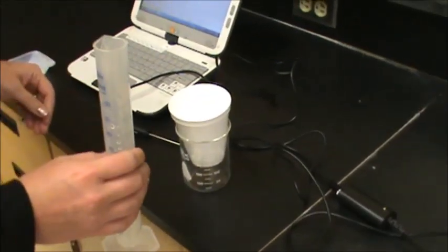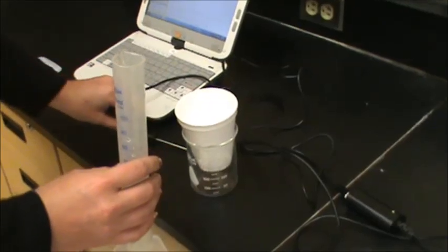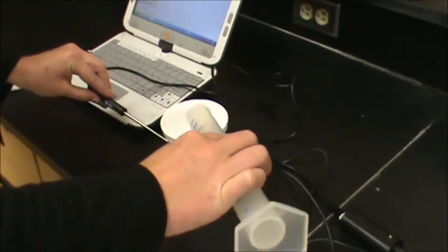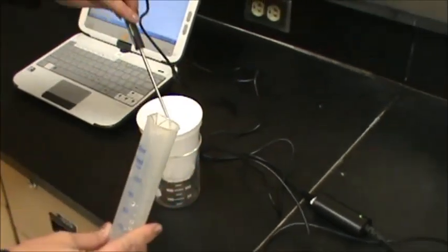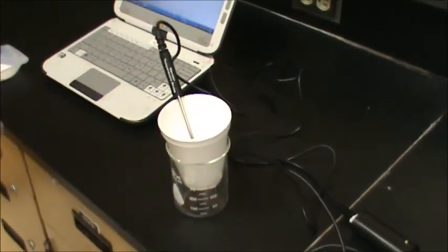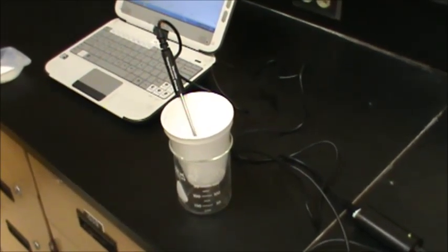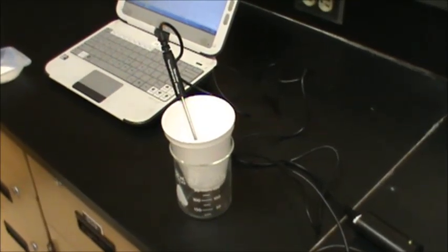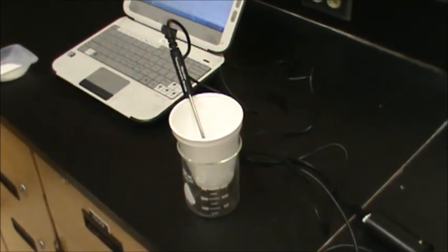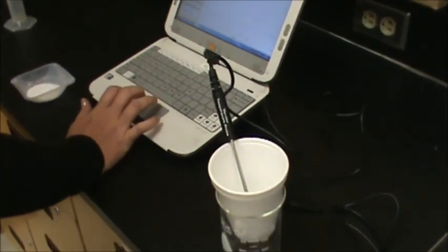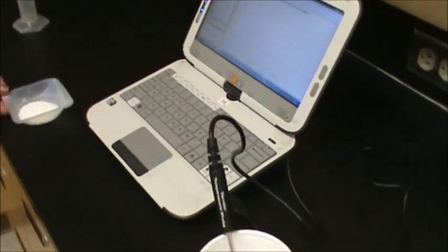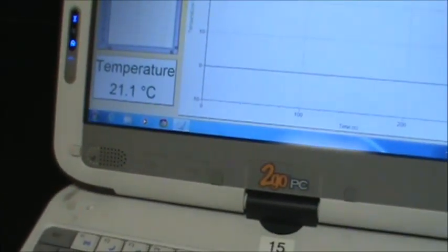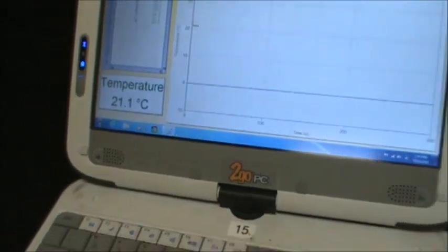In step six of the procedure, you're going to take the temperature probe and put it into the citric acid in your styrofoam cup. Let that sit for about 30 seconds, then begin data collection by clicking Collect. Initially, we see it's about 21.1 degrees — that's our initial temperature to start this reaction. You can see a nice horizontal line on the graph because the temperature is staying pretty much constant.